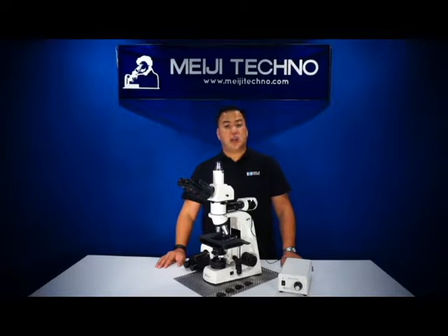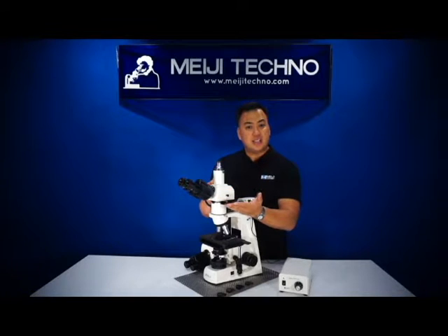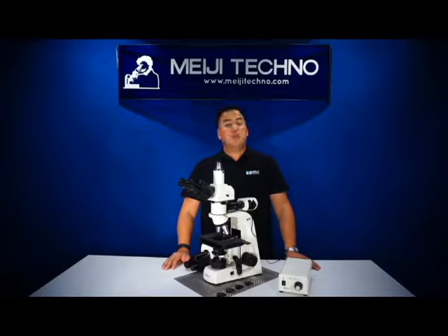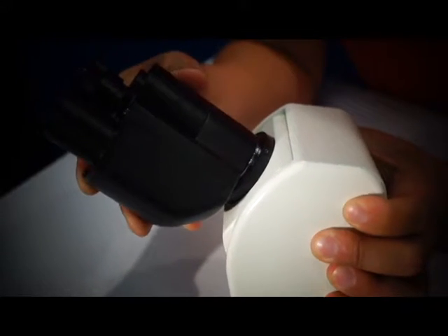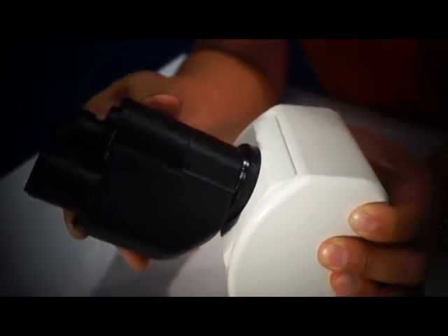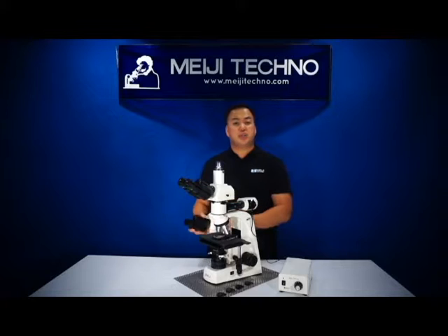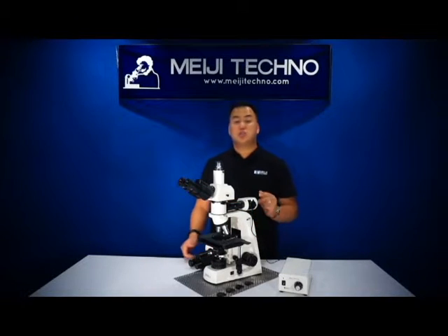Equipped with either a binocular or trinocular head, inclined to 30 degrees for comfortable viewing, it's also rotatable 360 degrees. The MT-8000 has an option of an ergonomic binocular or trinocular head giving an inclination of 10 to 50 degrees. This is a great option if the microscope is being used by users of different heights, as it reduces neck strain.